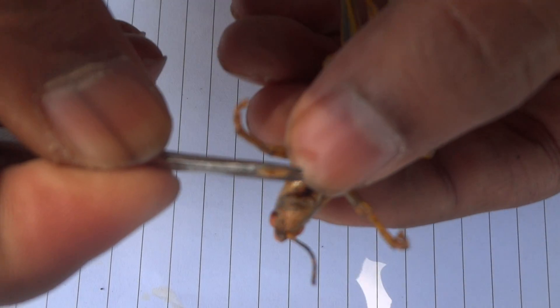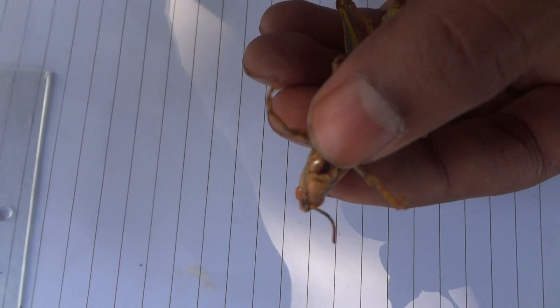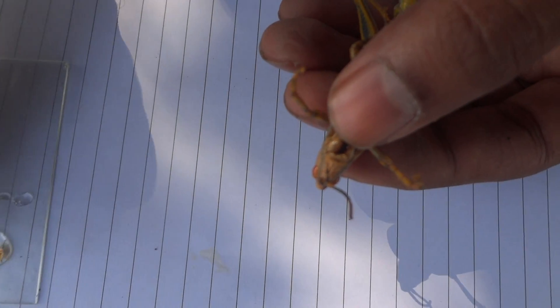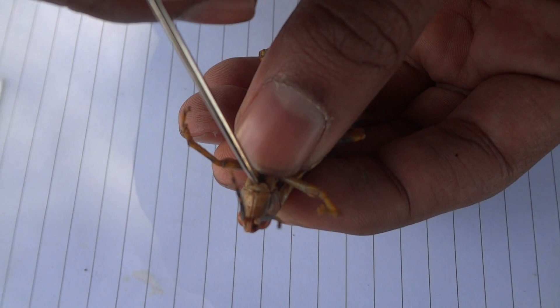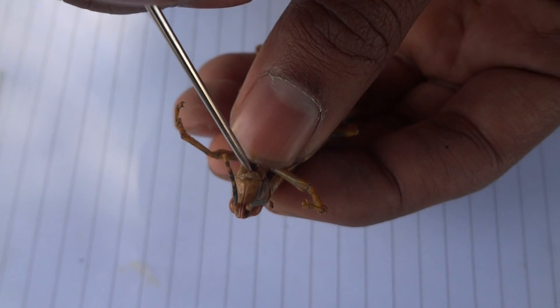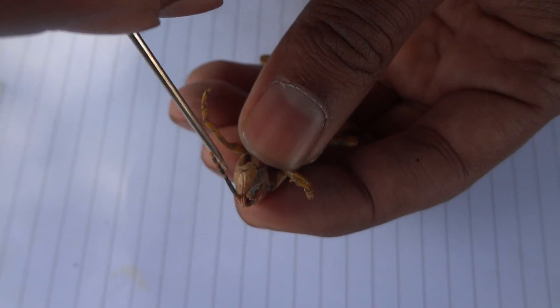This is the labrum — place it on the glass ring. And below the labrum you can see the mandible, because the grasshopper has a chewing mouth part. This is the mandible.